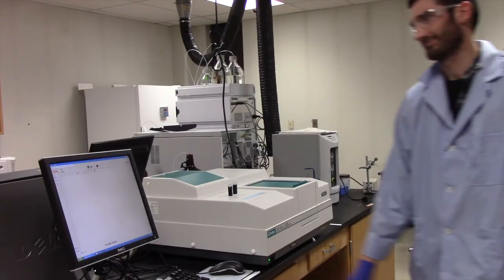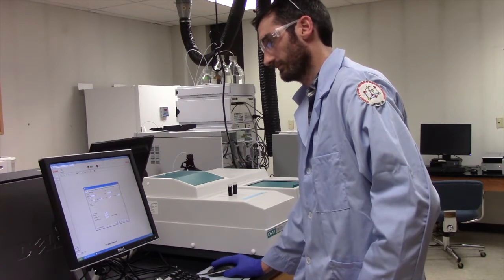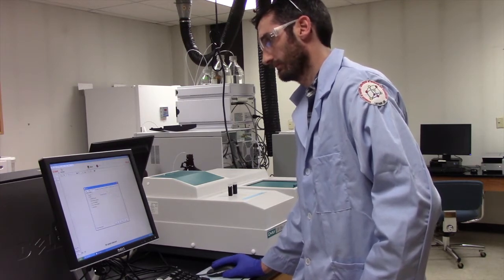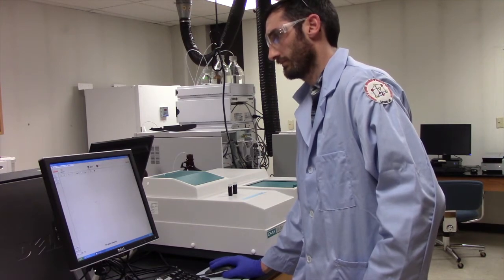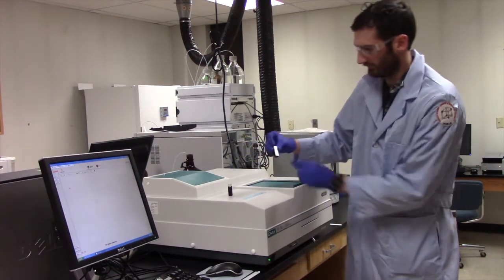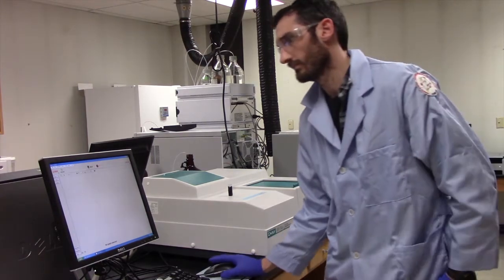Next, we will do a UV-Vis scan of your protein solution. We will use this scan to compare the concentration calculated from the molar extinction coefficient to your Bradford assay. First, using a quartz cuvette, blank the spectrophotometer.